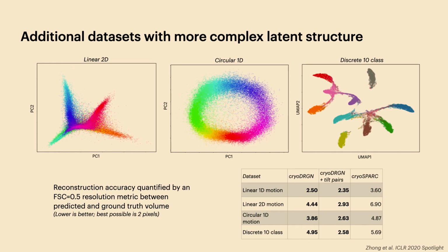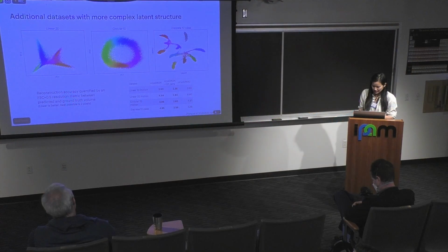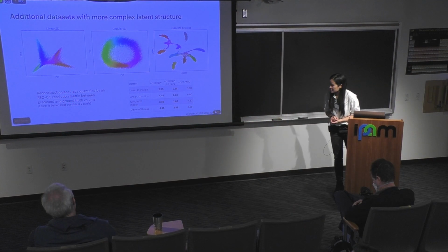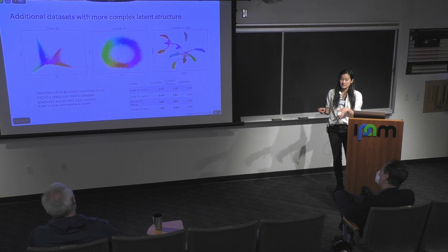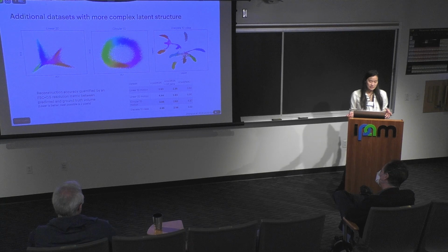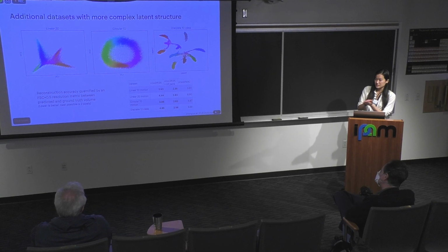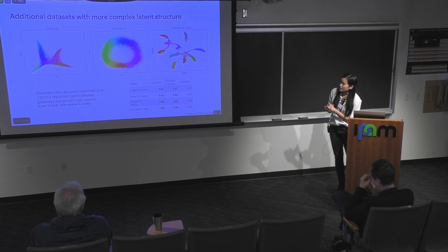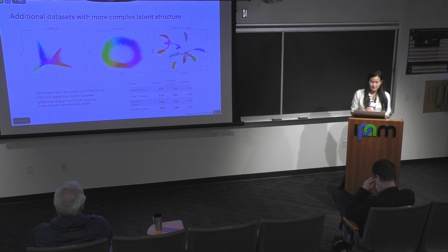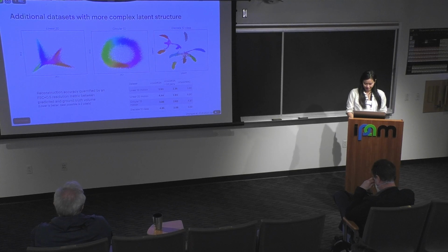That's the nice thing about the synthetic data set. There's one additional detail, which is that we were playing around with, instead of single particle reconstruction, encoding two images after doing a tilt series, and this definitely helps with representation learning of the latent space. I think that's what the images there are shown on the top row.